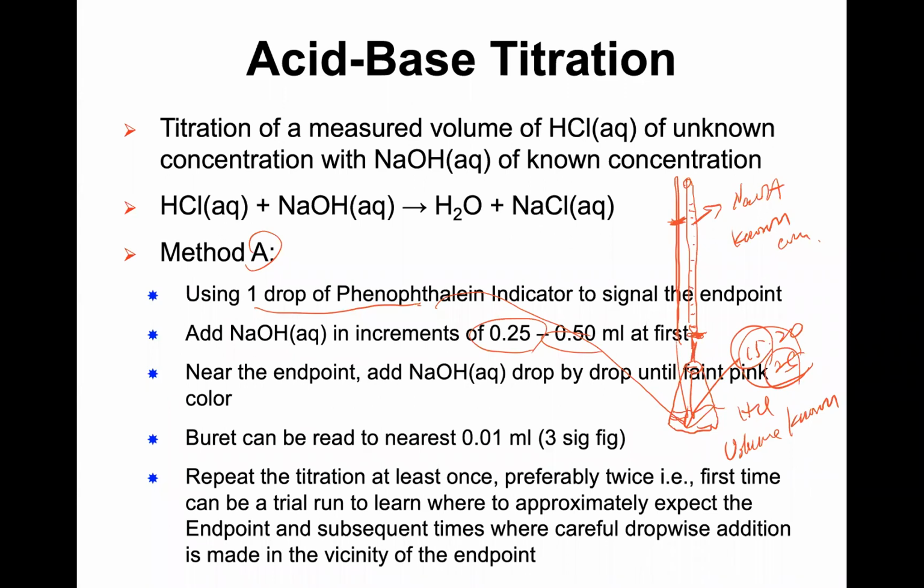Then you need to slow down. So you can see, add this drop by drop. Every drop you mix and shake this one and see if the color stays. If the color stays normally, roughly about 5 seconds, minimum 5 seconds, you don't see the color fade, then that tells you that's the end point, right?